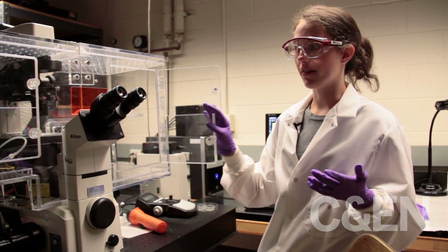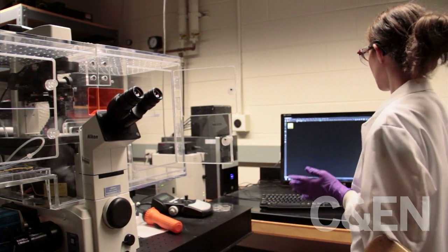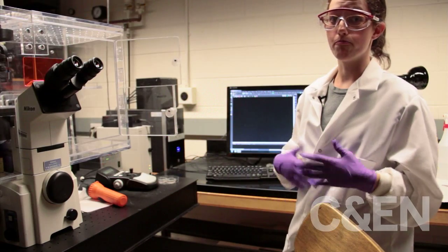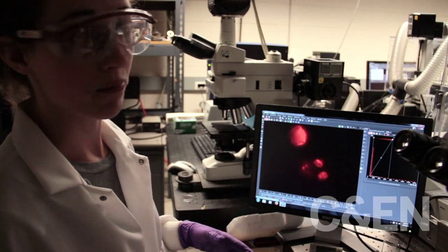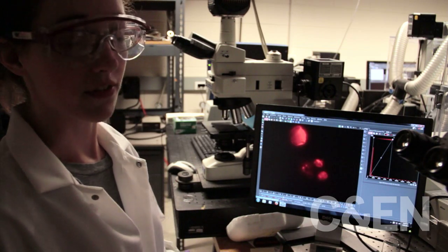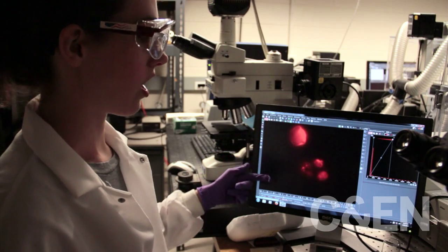When that's all finished, we look at them with the microscope. We are able to view the cells in a variety of different manners, both with phase contrast — which is what you see normally with your eye — and also with different fluorescence. Right now we're looking at images of cancer cells that have been targeted by quantum dots. This fluorescence, or glowing, is the quantum dots attached to the cell membrane. The video is looking at different focal planes, focusing on the bottom of the cell and then up to the top of the cell. You can see that the glowing is the brightest around the perimeter of the cell where the quantum dots are adhered.